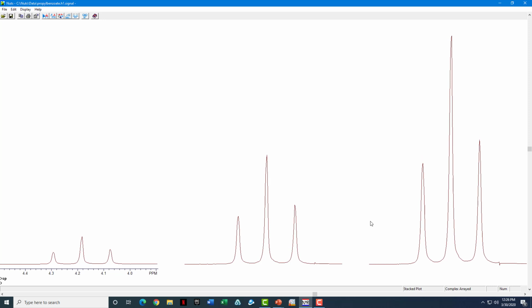When you click in the background, a red crosshair comes up, and in the bottom right hand corner over here, the position of where the intersection of the 2 lines is shown in points, hertz, and ppm. Likewise, the height of the horizontal line is shown on the far right. We're going to use that right now. Let's click and hold the horizontal line at the tallest point on the far left spectrum, and we'll look on the right hand side for height.